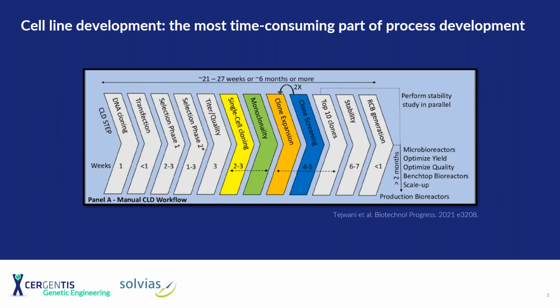With the rise of biopharmaceutical candidates in the pipeline, there is an ever-increasing need to streamline the cell line development process to mitigate risk and accelerate early phase testing. Unfortunately, what we also sometimes see happening with some companies is that when their drug development program is near the finish line, just when they are about to get ready for clinical trials, they unexpectedly pick up a genetic sequence variant in their original MCB, which then leads to months of pushback on filing their IND.